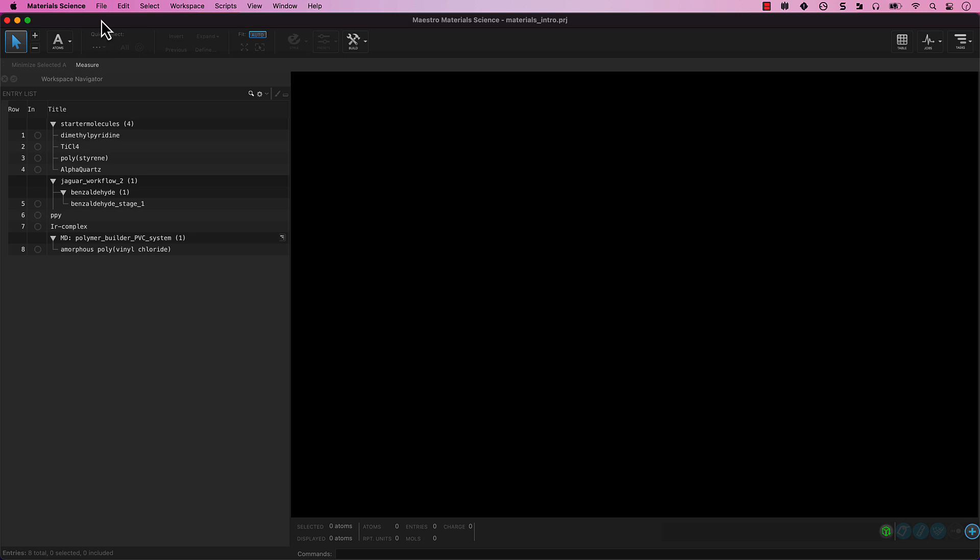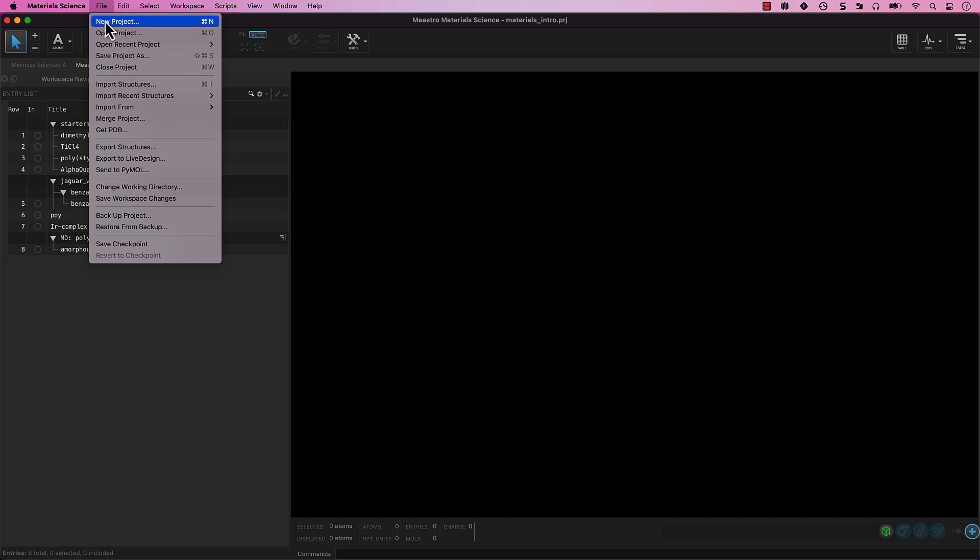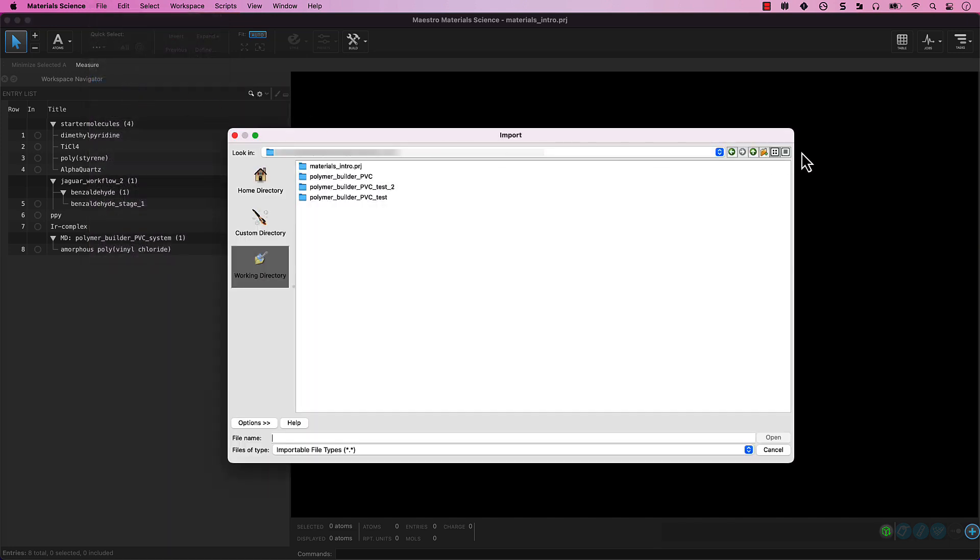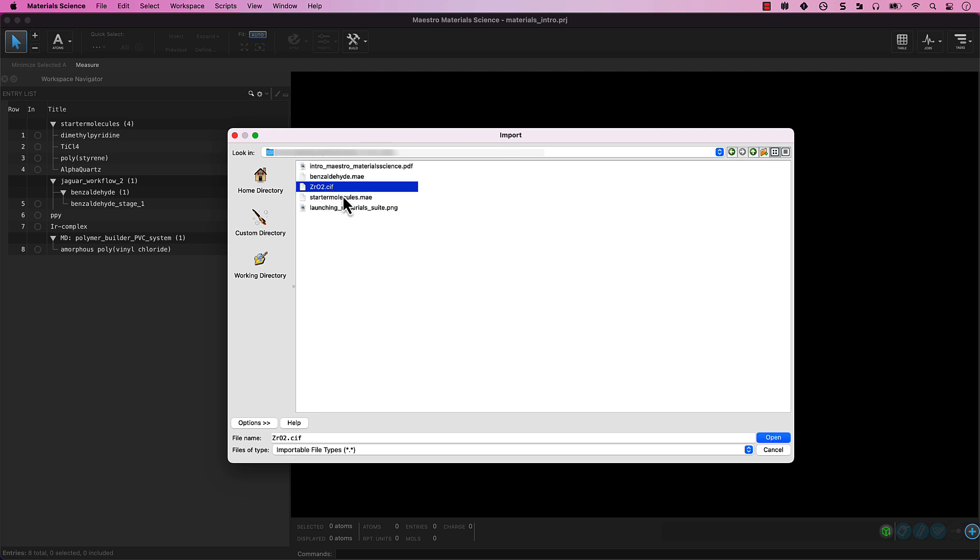From the main menu, go to File, Import Structures. Navigate to where you downloaded the intro files and select the provided ZRO2.sif file. Click Open.